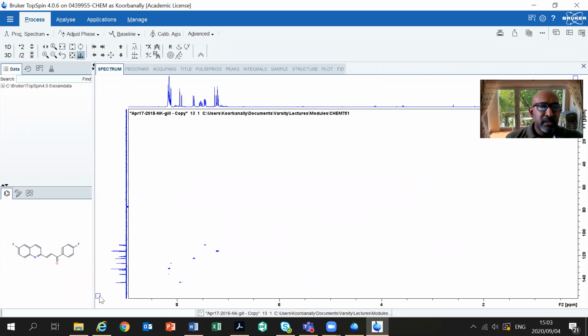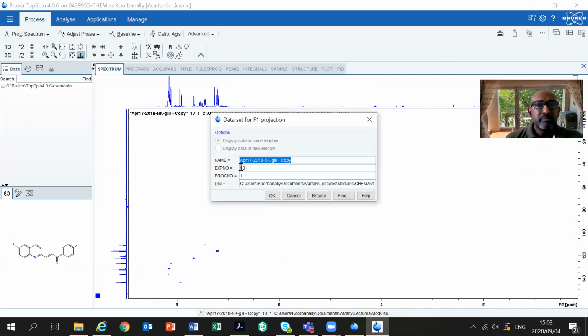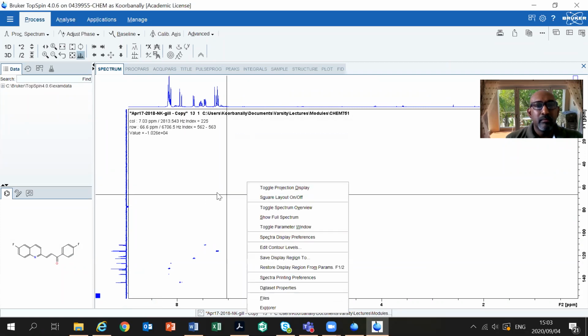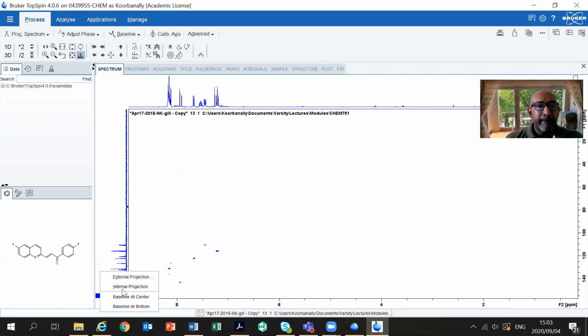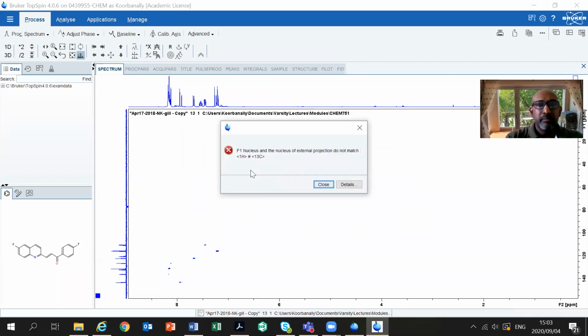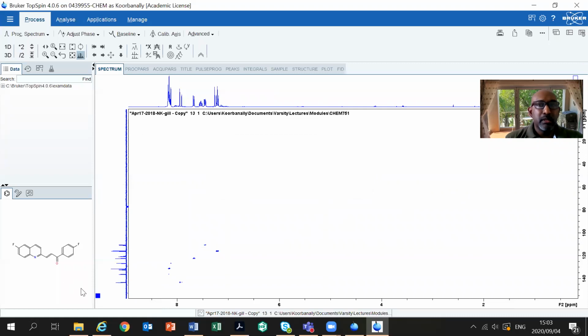I'm just going to mess this up a bit, just to show you something. I'm just going to mess it up slightly. Okay, I'm not getting the nucleus to match.